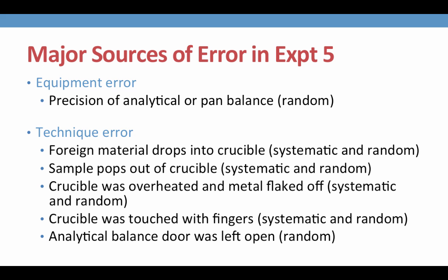Technique error are things that we can try to avoid, and you should do your best to avoid them. Keep your crucible lid on whenever you are not heating the sample. This will prevent foreign material from dropping into the crucible, such as dust or a hair. Again, make sure you do keep the crucible lid on, but slightly ajar, while it is heating, so that no sample will pop out of the crucible. Remember to always move your Bunsen burner flame around the crucible to prevent it becoming overheating and oxidizing.